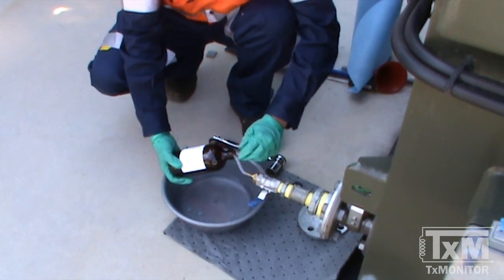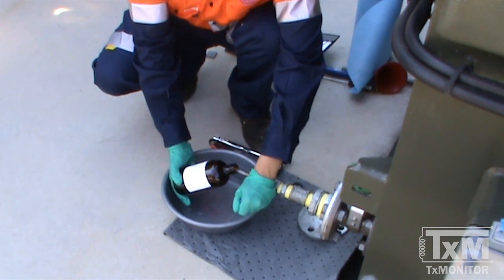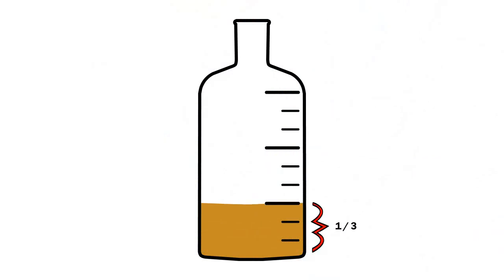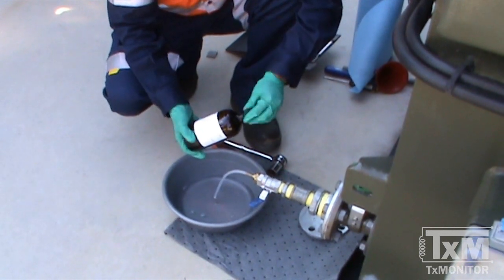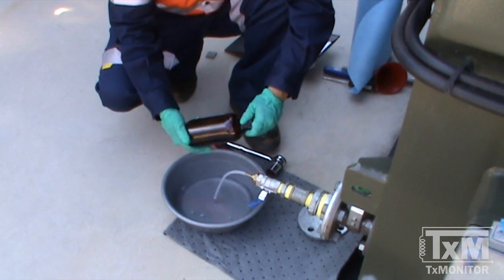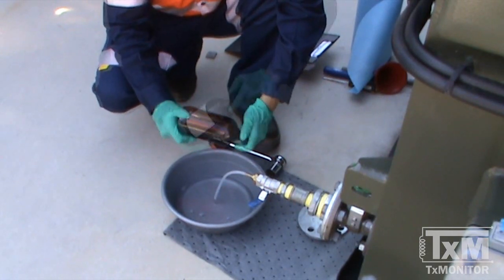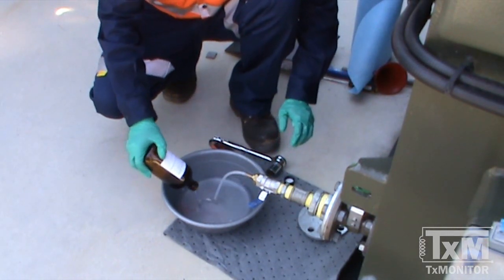Place the tubing into the sample bottle. While holding the sample bottle at a slight angle to limit the aeration, partly fill the bottle. Gradually turn the bottle to allow the oil to swirl and warm the bottle — this helps prevent condensation. Discard the contents and repeat the process two to three times.